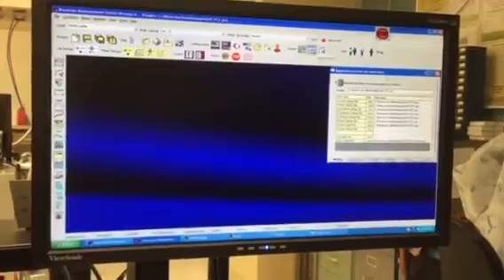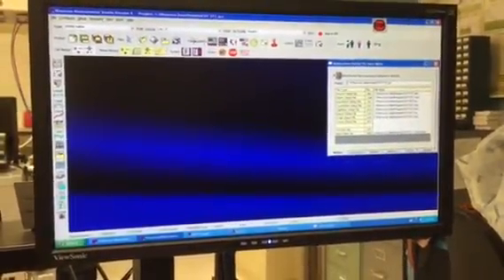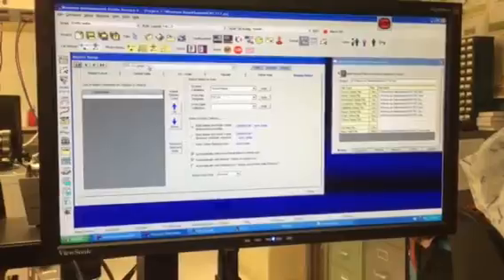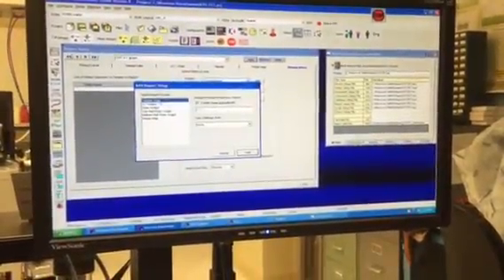The last thing I need to know is how can I extract the data and tabulate? Yeah, so let's do that next. So now let's add a new report. So same area, we go back out to reports, and we have to build a new one based on tabular reporting. No, okay, now it's graph. I just need to tabulate data.